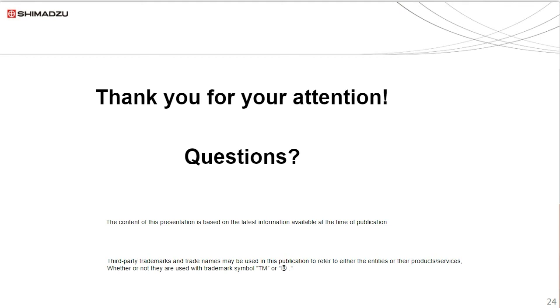Okay, good. So the next question we have is: to analyze nutrients in plants, is digestion required, or is digestion only for heavy metal analysis? A short answer is yes, and the reason is that ICP-MS works by nebulizing a liquid sample into a glass chamber, and that chamber creates a fine mist that's pushed into a plasma. So the sample itself has to be in liquid form.